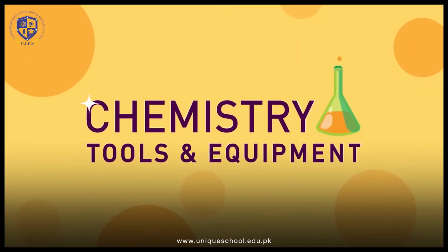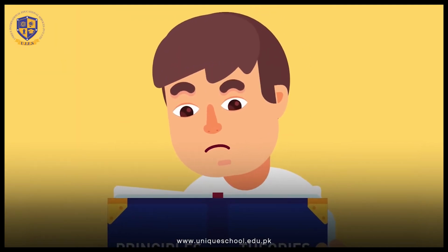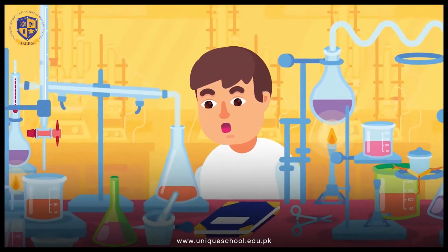Chemistry tools and equipment. Before we begin with the principles of chemistry, let us review what kind of glassware and equipment we use to study this broad subject.